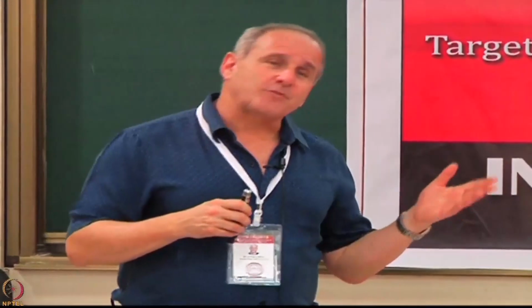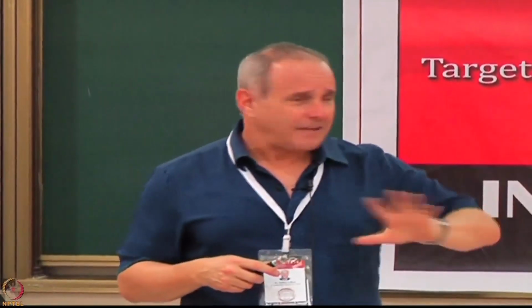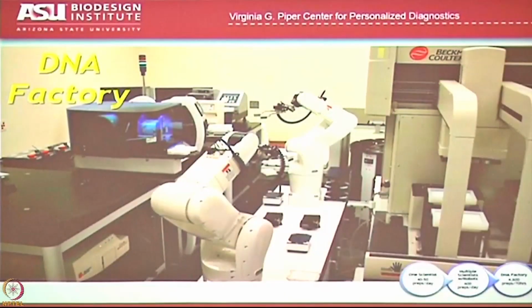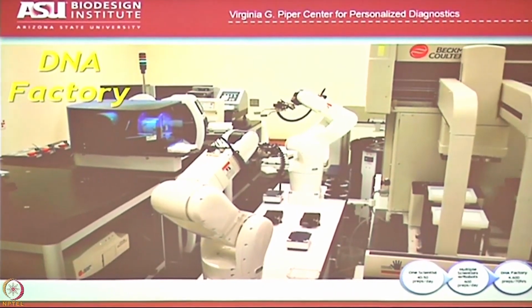Just to give you some frame of reference, when I did DNA mini preps in my day, if you did 50 in a day, you were working your butt off. But with robots, you could get up to around 600. Okay, since then, in Arizona now, we have this technology. So we've taken that robot technology, which we used to call SneakerNet, which is you connect one robot to the other by a graduate student who runs from one to the other, to a fully automated platform.